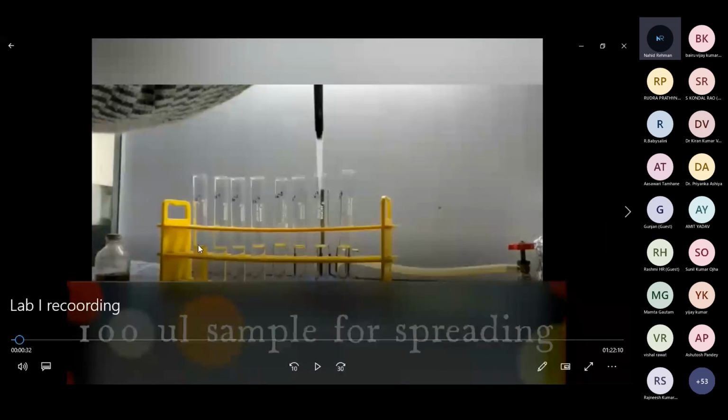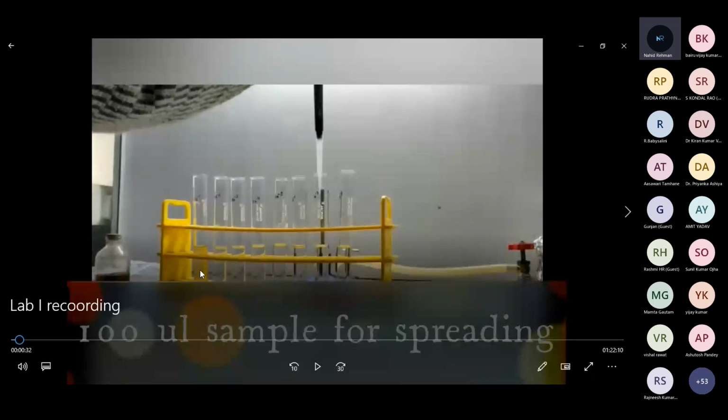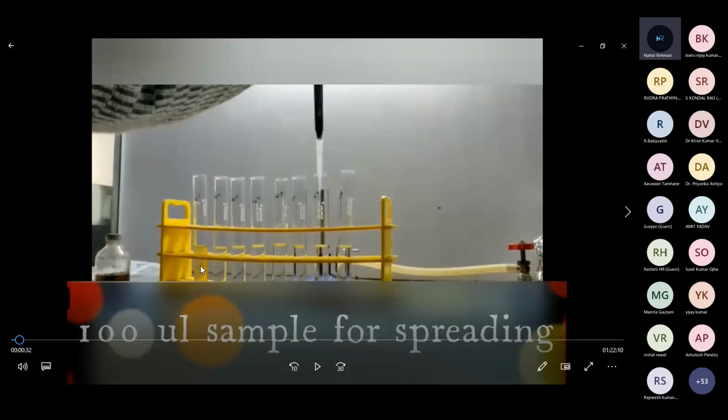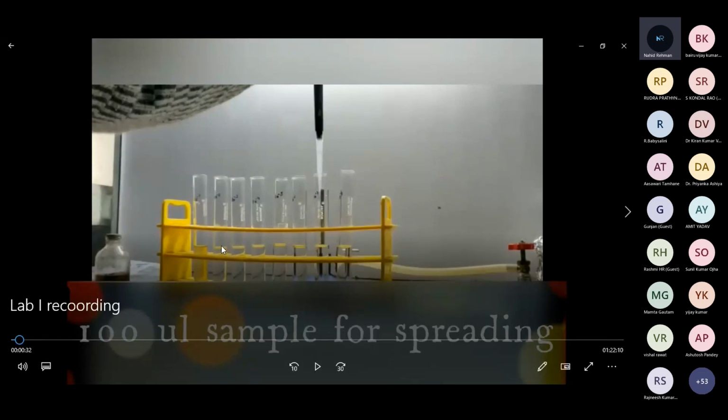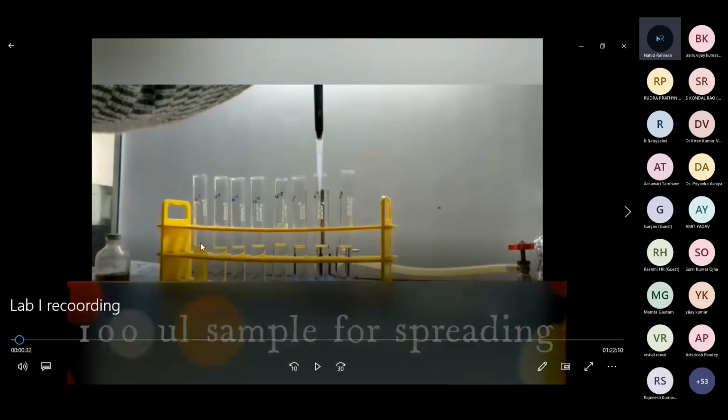So the difference between the first and second tube will be tenfold, because the first tube will be regarded as 10 to the power minus 1 dilution, because from 1 ml of the culture you diluted it with the buffer or saline to 10 ml. And then from this first tube you are taking 1 ml and mixing it into another tube. So here also you are diluting it tenfold. So this will be 10 to the power minus 2, and so on.